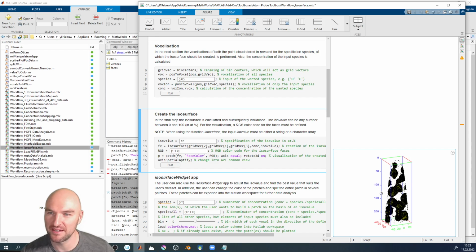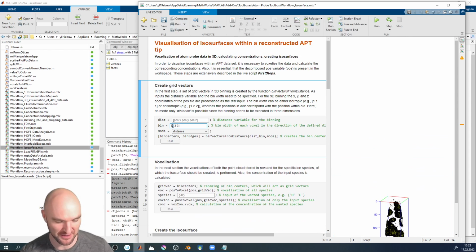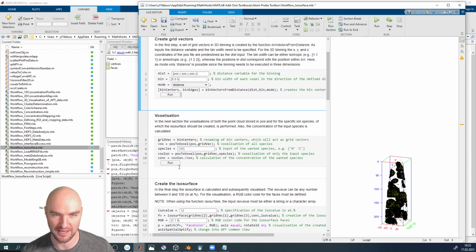Maybe 3 nanometers on this extremely large data set is still a bit large, yeah? So let's rerun it with 5 nanometer voxels. That's a pretty big voxel size. By the way, if any one of you is tempted to ask what an optimum voxel size is, there isn't one. A voxelization is a histogram, and histograms have no optimum binning. This is mathematically not a thing.